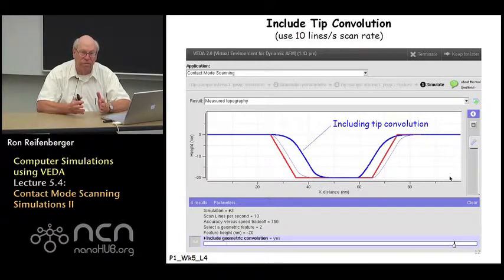And so if you're trying to adjust processing conditions to get a certain width of the step or a certain width of the trench, and you use AFM to verify the width of the trench that you've etched, this clearly shows you that you're going to miss on the etching conditions, because you're going to think that the trench is actually not as wide as you think it is, right?